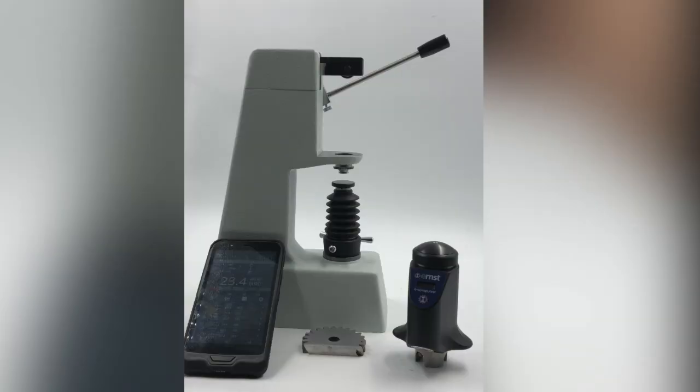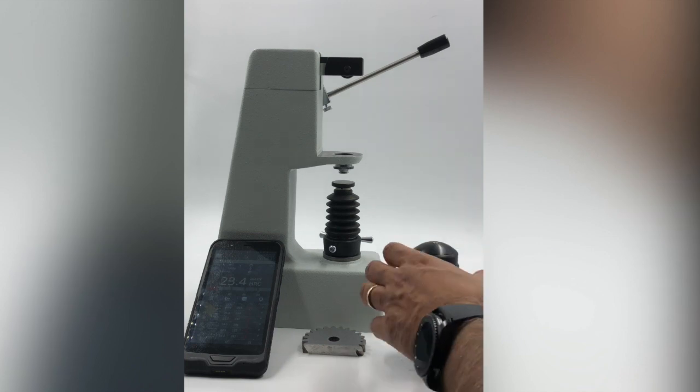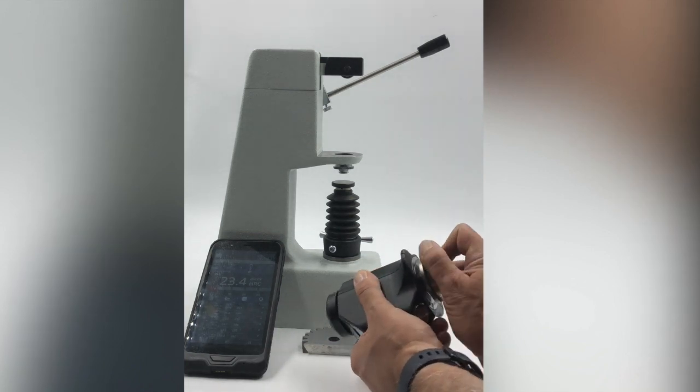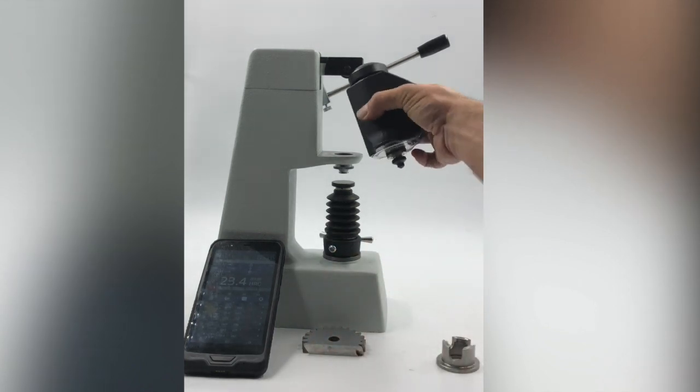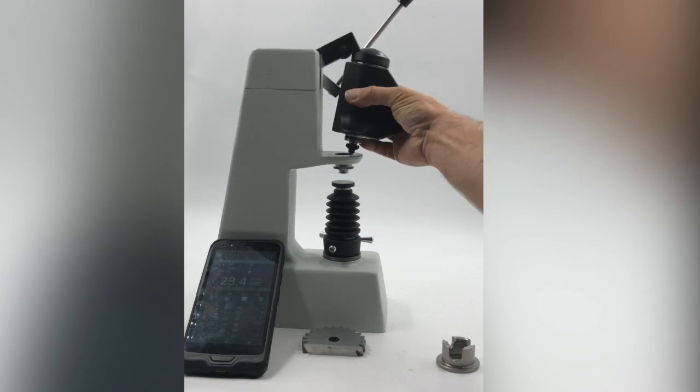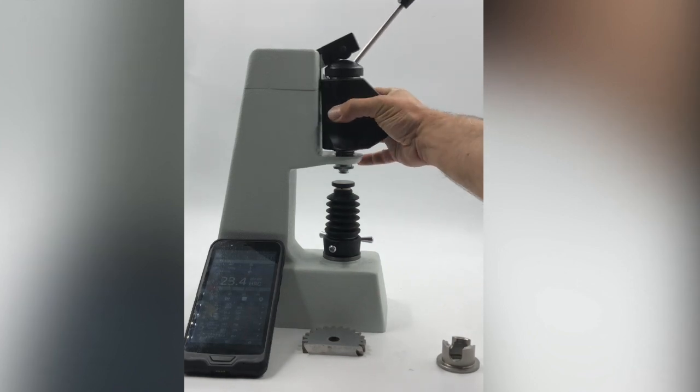For accuracy, we can transform our portable unit into a bench instrument. Very simple. Let's remove the standard base and place the instrument on the bench.